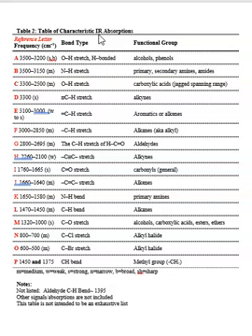apply to a sample. And now the sample size is going to be small. It will be drops, for example, very small. And what happens is we measure how much of the wavelength is absorbed by that sample. And when we do that, we can actually determine what kind of functional groups, what type of bonds can be identified in a substance. So the general idea of IR absorption or infrared spectroscopy is to find functional groups right here. So just remember that.